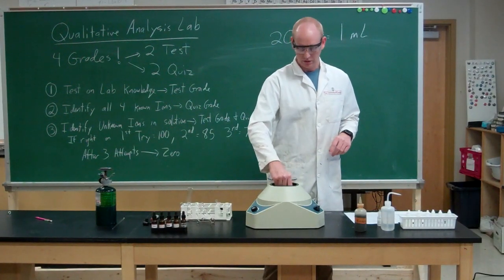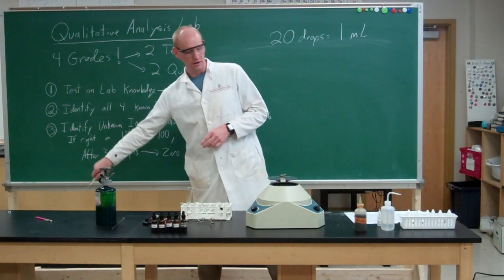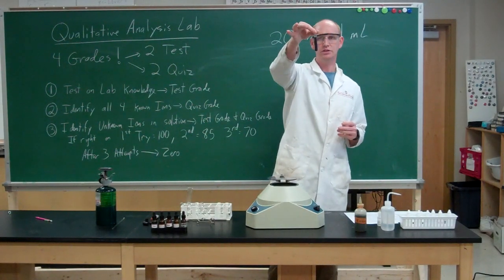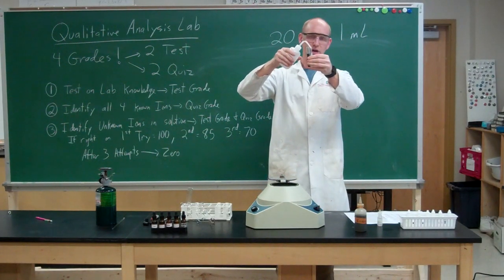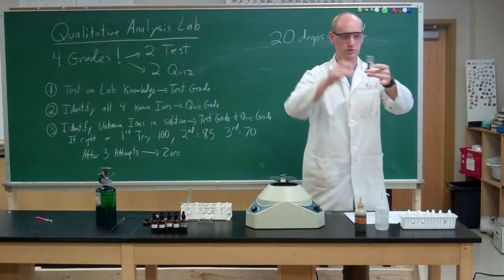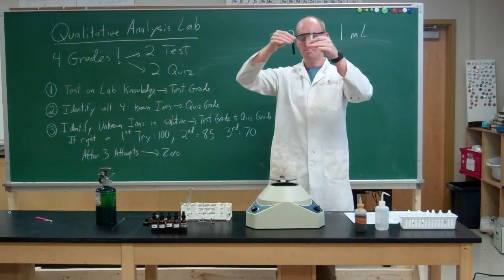So, to counterbalance a centrifuge, you have your test tube you want to centrifuge, and you're going to take another test tube, and you're going to add water. It can be distilled water, it can be regular water, until they have an equal amount of liquid in them. So, I have the test tube I want to separate, and I have my balance test tube.